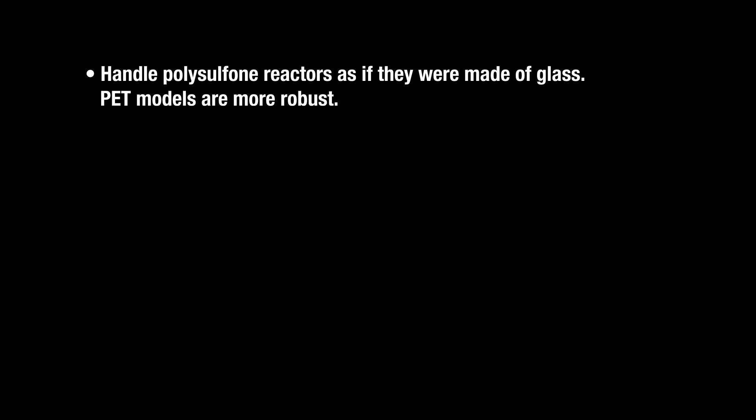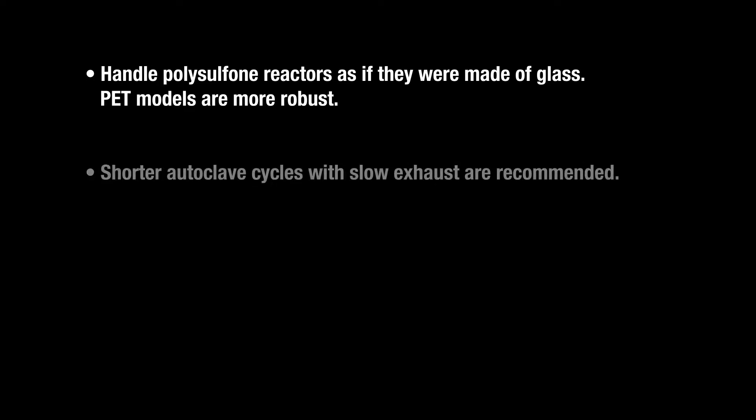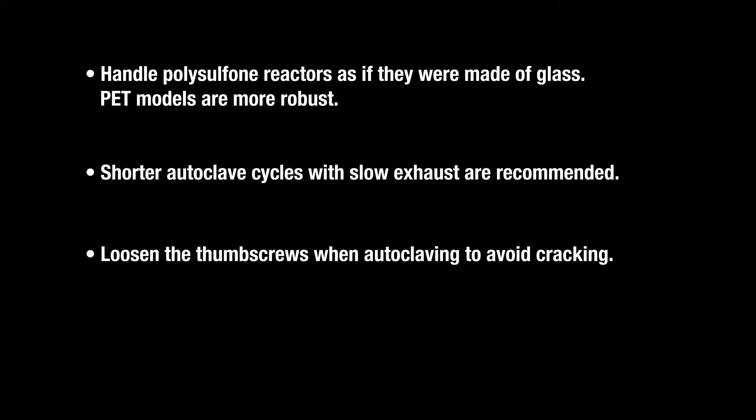Handle polysulfone reactors as if they were made of glass. PET models are more robust. Shorter autoclave cycles with slow exhaust are recommended. Loosen the thumb screws when autoclaving to avoid cracking.